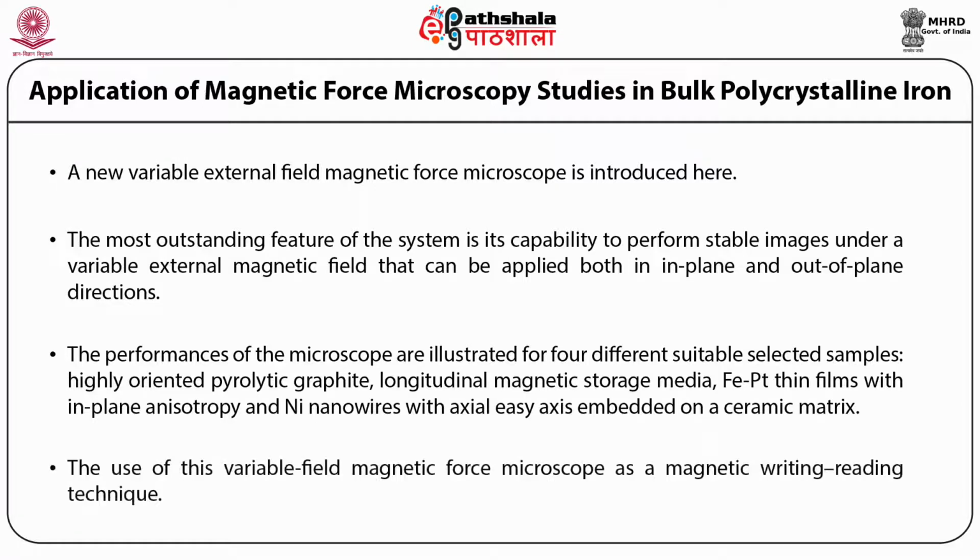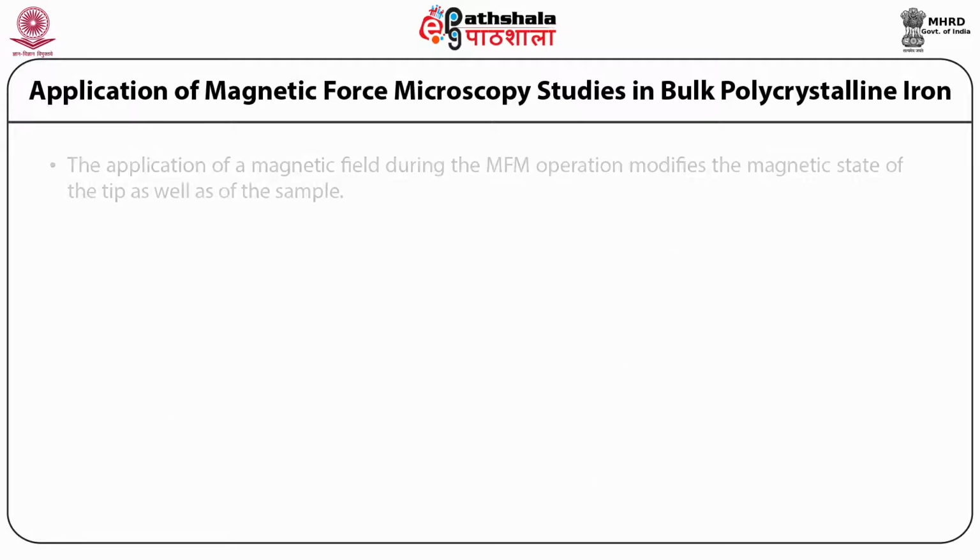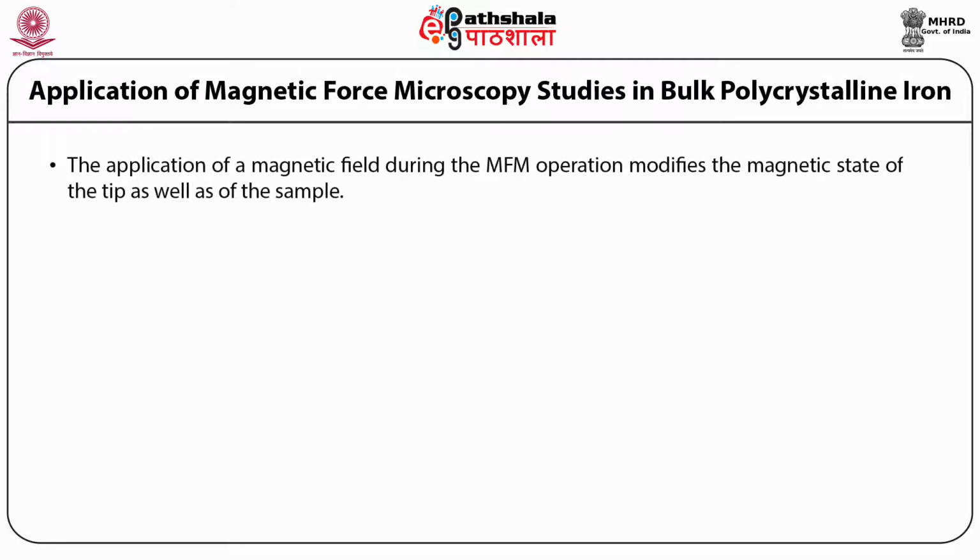The use of this variable field magnetic force microscope as a magnetic writing reading technique. The application of a magnetic field during the MFM operations modifies the magnetic state of the tip as well as of the sample.